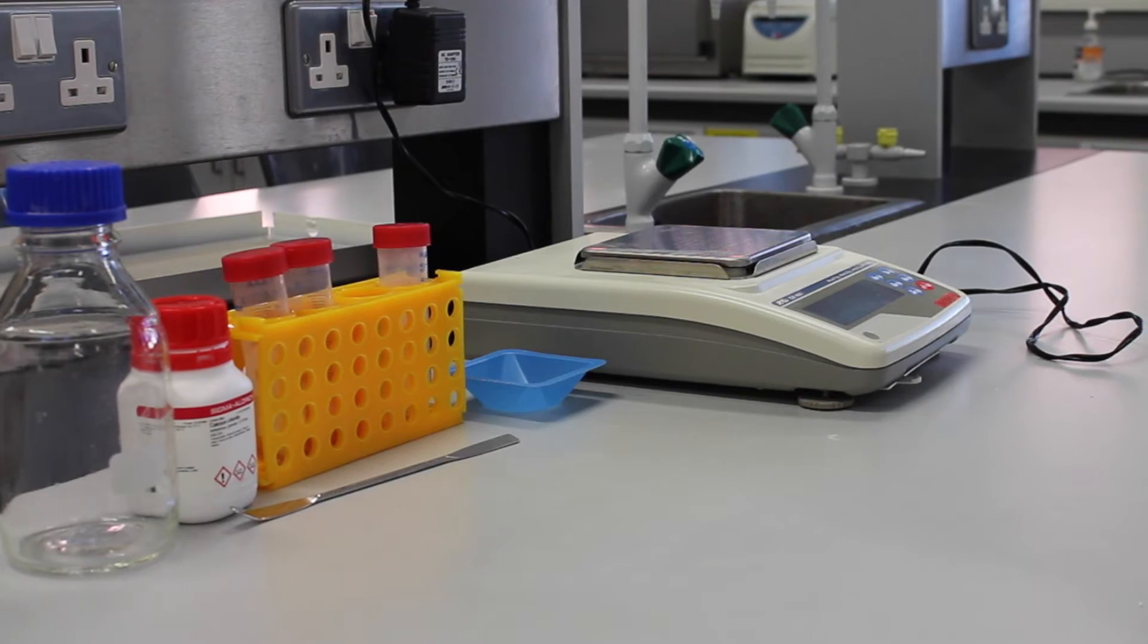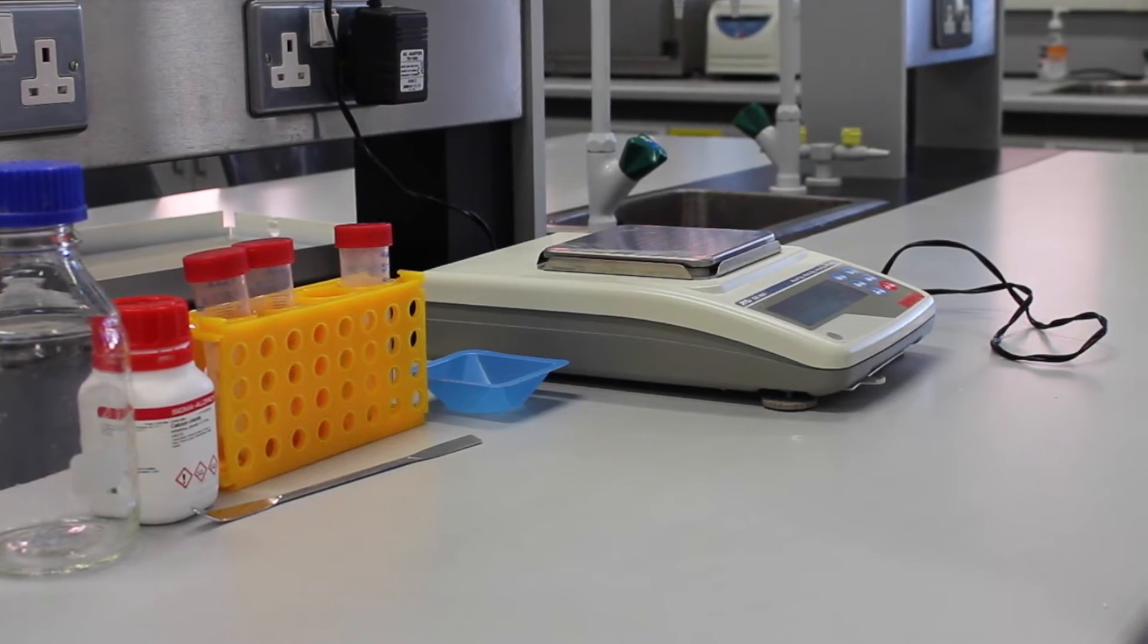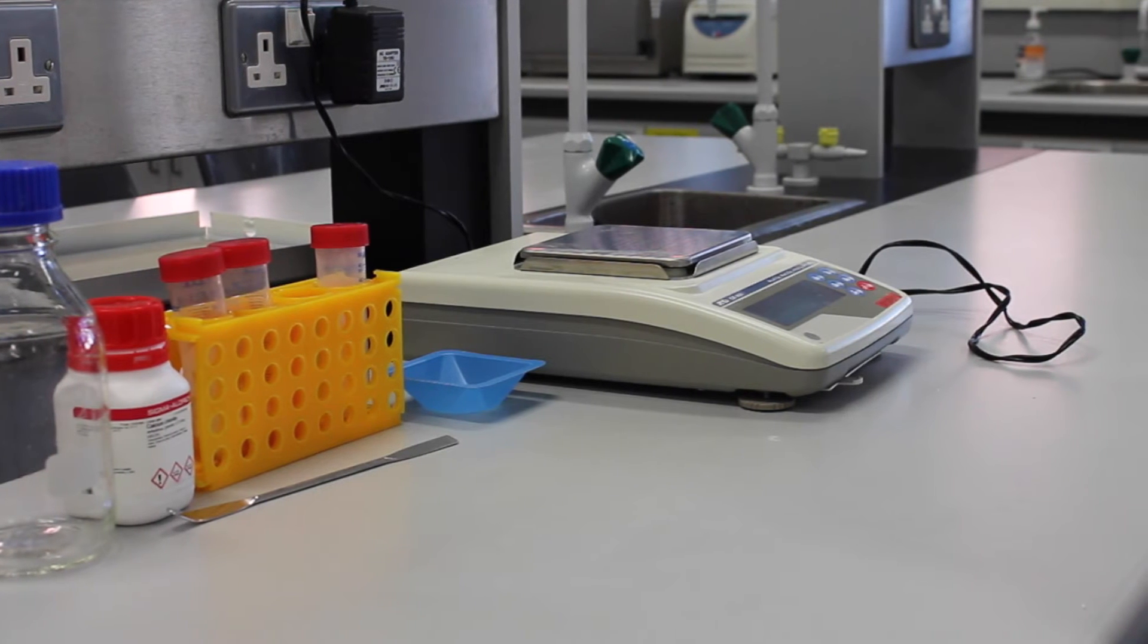Before continuing with the process of making competent cells, make sure to have the CCMB80 buffer. The CCMB80 buffer is prepared by combining in a glass bottle.